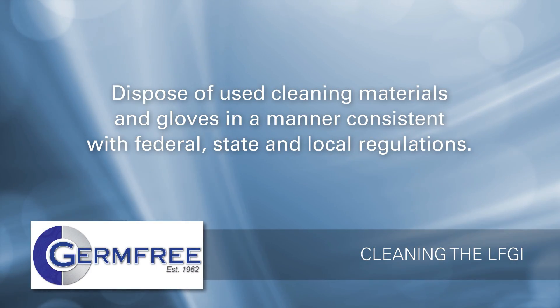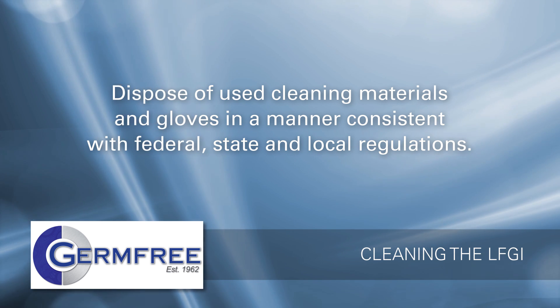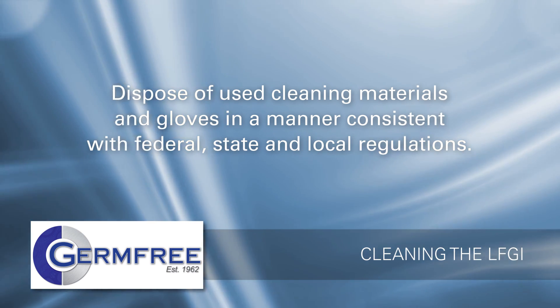When cleaning, pay special attention to controlling the spread of contamination from the work area and dispose of used cleaning materials and gloves in a manner consistent with federal, state, and local regulations.